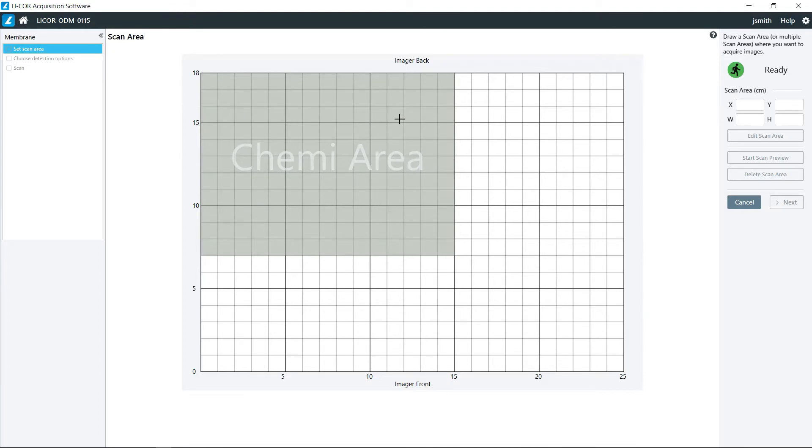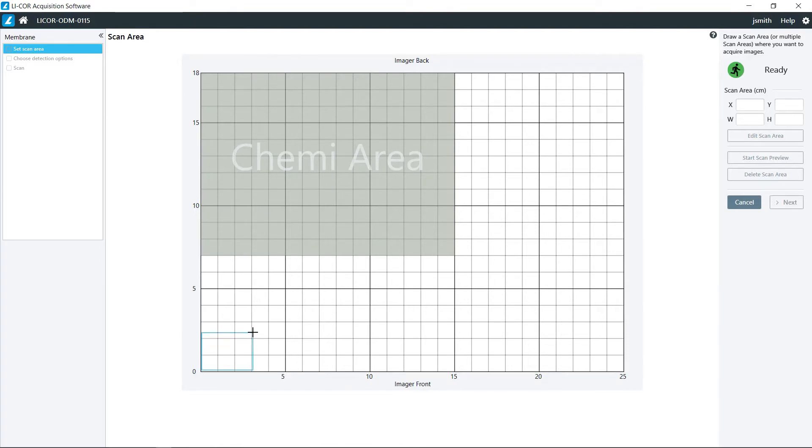This is the only area that can be used for chemiluminescent blot, but for fluorescent membranes they can be placed anywhere that is suitable for you. Then just click and drag your area that you want to scan.